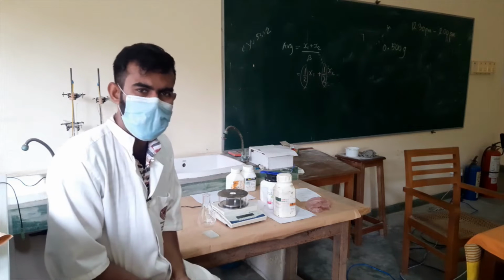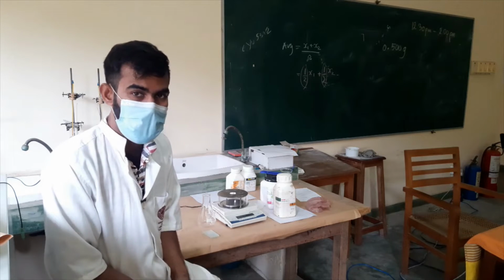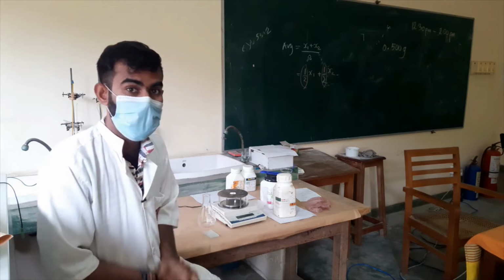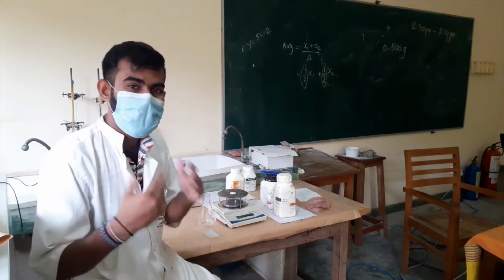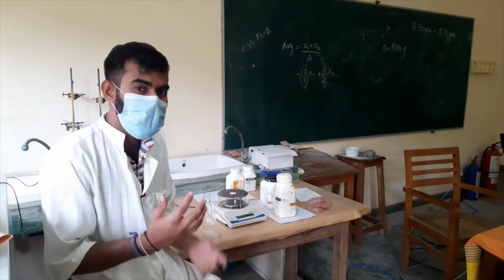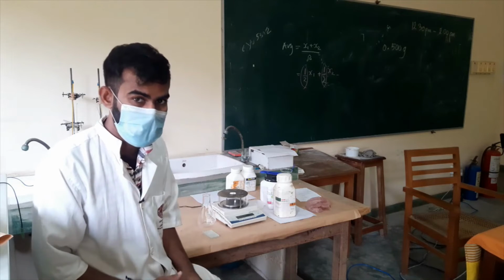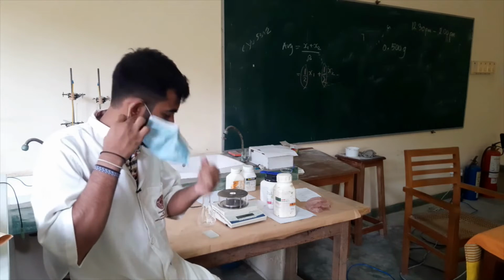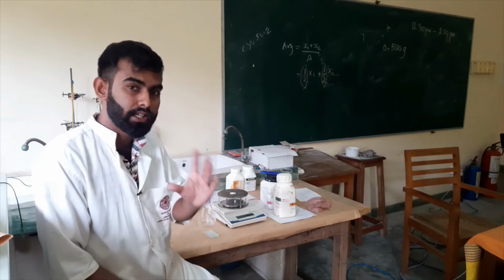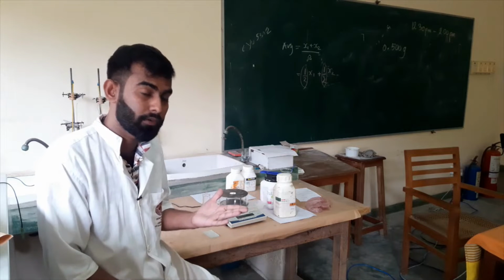In experimental labs, especially in organic chemistry labs, we do column chromatography, thin layer chromatography, and likewise other chromatographies. Sometimes we also use paper chromatography. Sometimes we use TLC plates. Actually, TLC plate means thin layer chromatography technique.